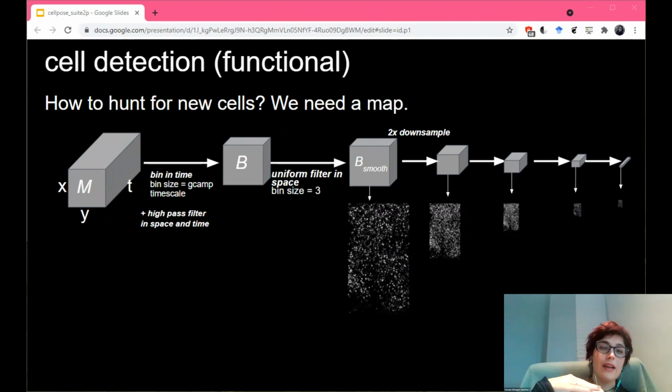So you can lower that if, for instance, you're not finding cells, and it will go in and find those cells that maybe are small or not quite accommodated there. So if they're big and they're over a couple bins, then you'll eventually agglomerate them at a map down here. But if they're small and divided across things, then maybe you do need to decrease your threshold for finding cells.